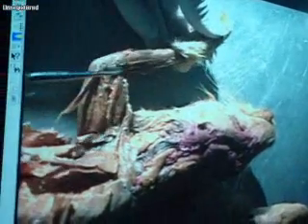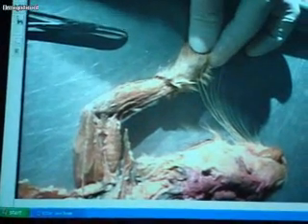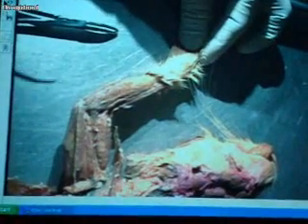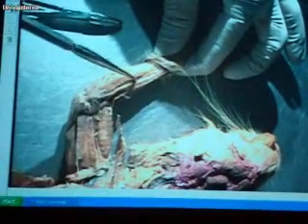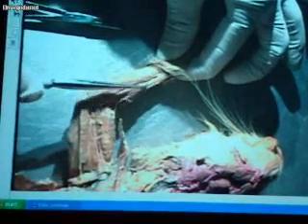Coming down in the front, this is where it gets really sticky. Looking at the inside of the lower portion of the arm, starting all the way over by the thumb, you can actually feel there's a bone right here — the radius. Lying against that radius are two muscles.